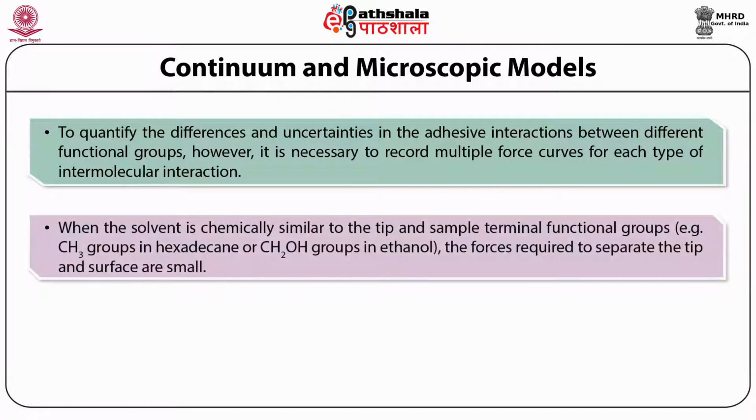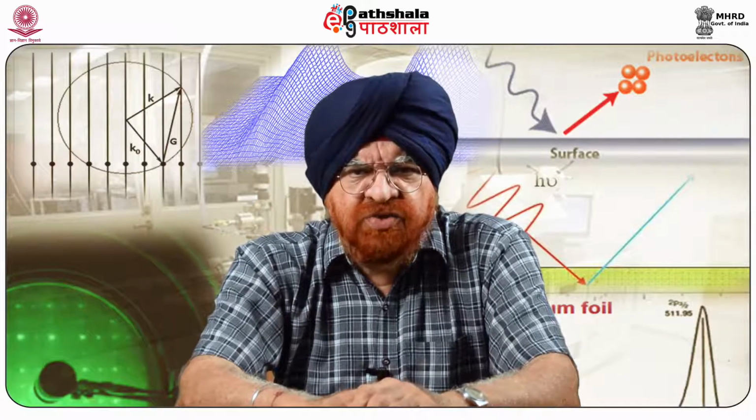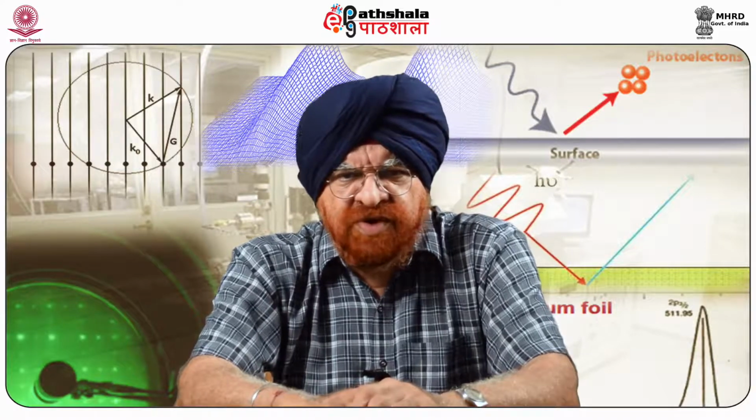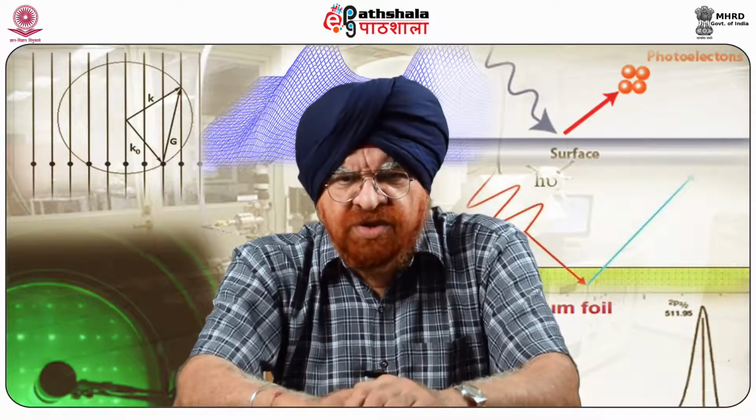When the solvent is chemically similar to the tip and sample terminal functional group, for example CH3 groups in hexadecane or CH2OH groups in ethanol, the forces required to separate the tip and surface are small, at times very small.